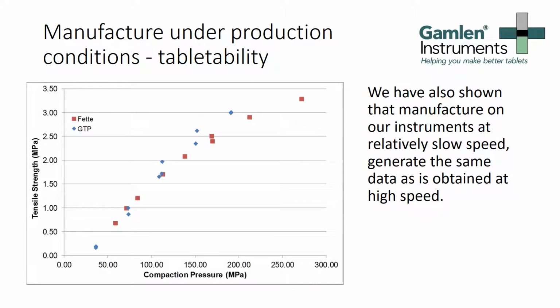We also wanted to make some comparisons between the properties of tablets made on our system and the properties of tablets made on the production scale. We were very fortunate to have the assistance of Dr. Kendall Pitt of Glaxo Manufacturing Services, who generated and published some test data with us.